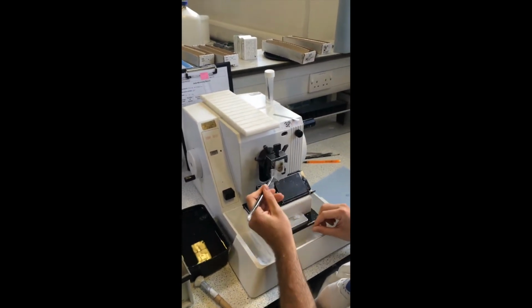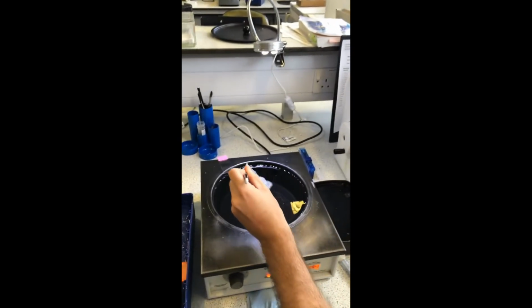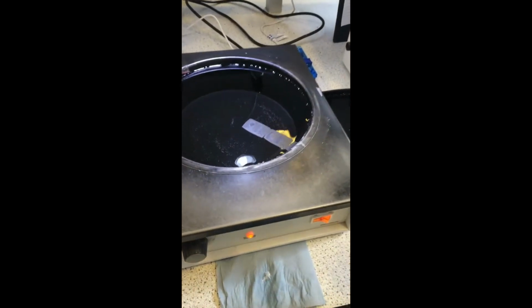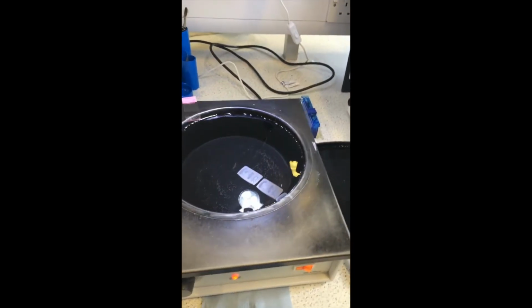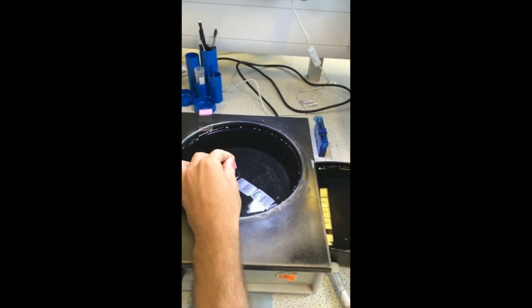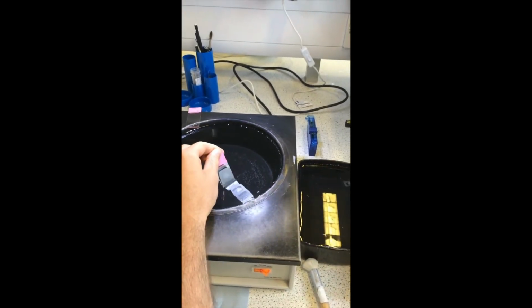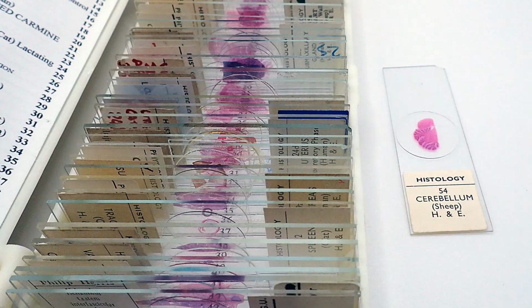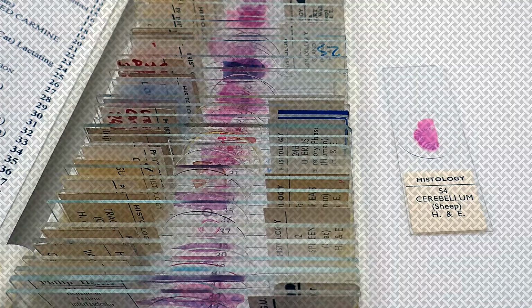We then mount these sections on flat glass slides. And then we stain the slides with chromatic dyes, which give the samples colour and contrast.